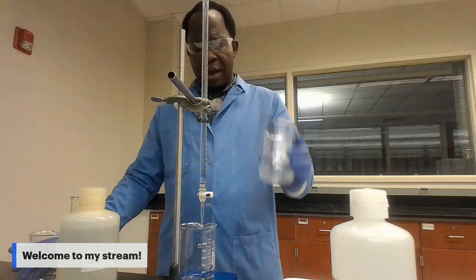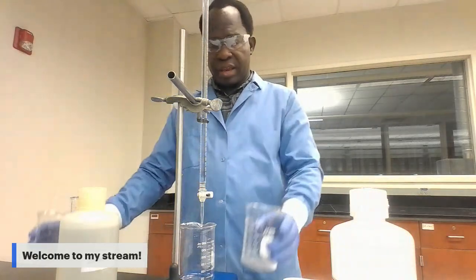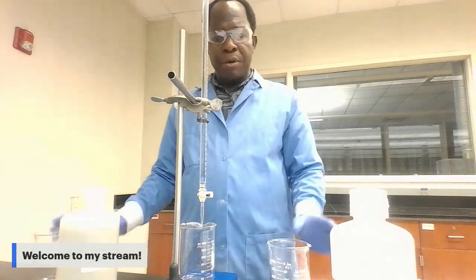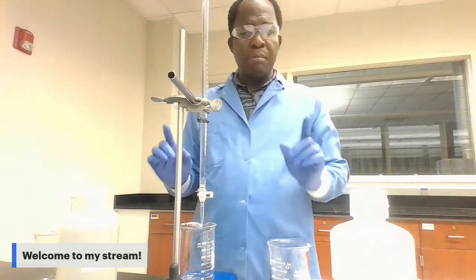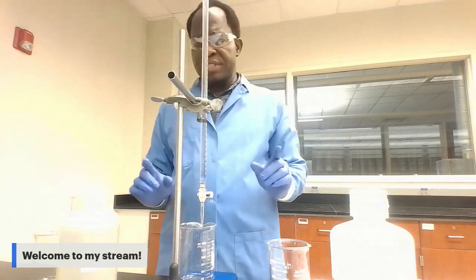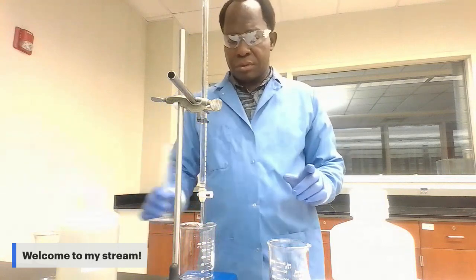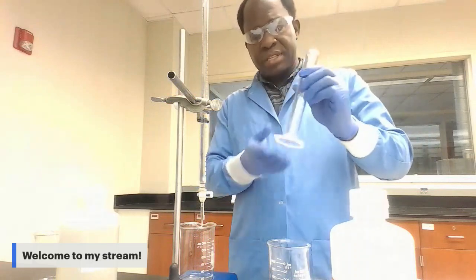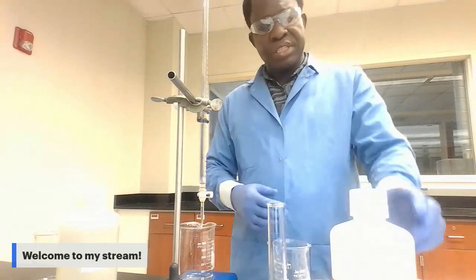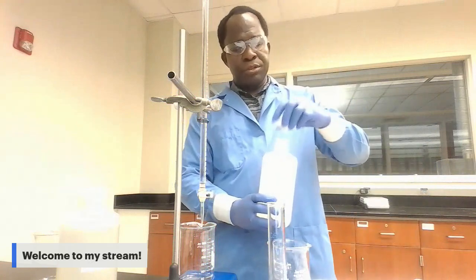I already have my three beakers here. I'm going to fill the three beakers with 20 milliliters of Ca(OH)2 each. I have my graduated cylinder, which you should have too, and I use it to measure the Ca(OH)2.